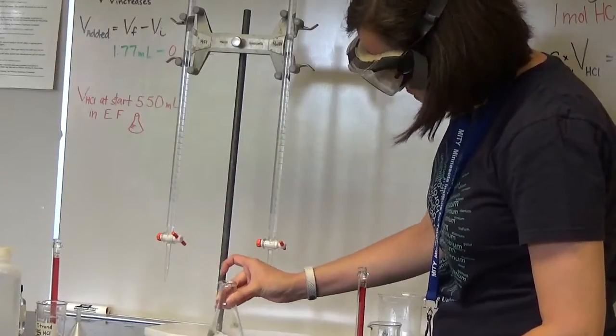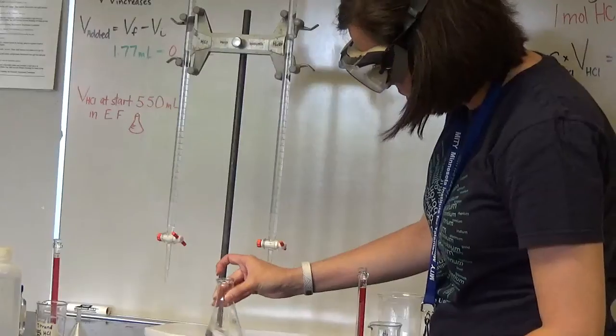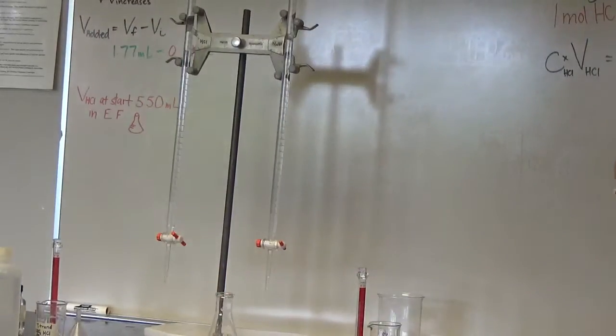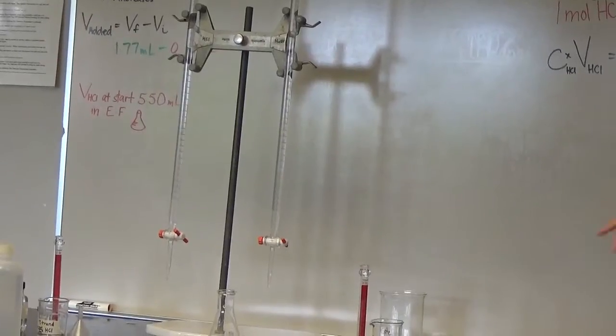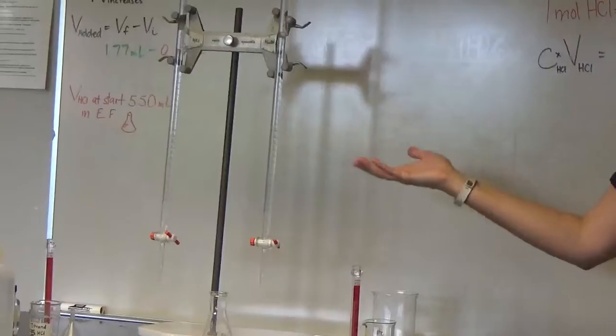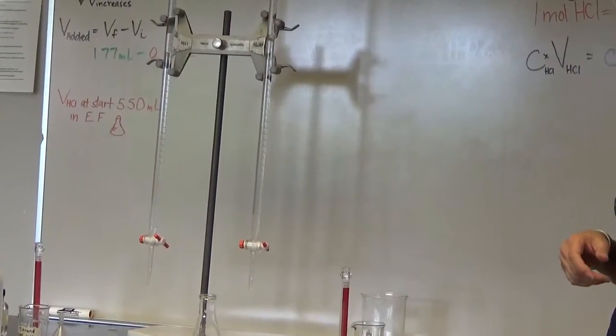Did about 2 drops of NaOH on that one, and it looks like it was just ever so slightly too much. I probably should have done just 1. But you're going to be doing this process over and over again. You don't need to continue to re-clean it each time. You now know what's in it and you're not changing what you've got.